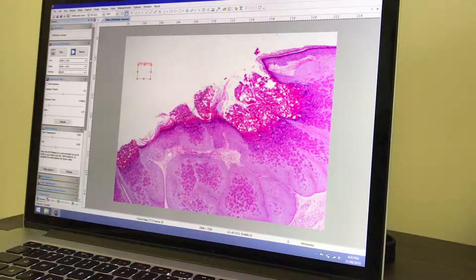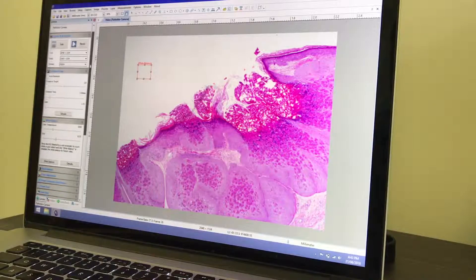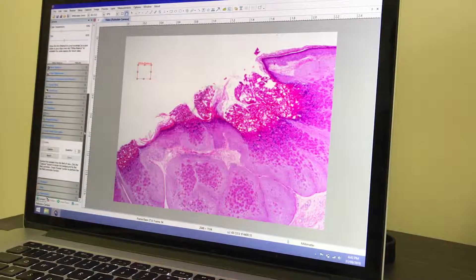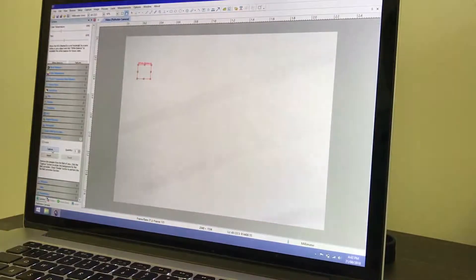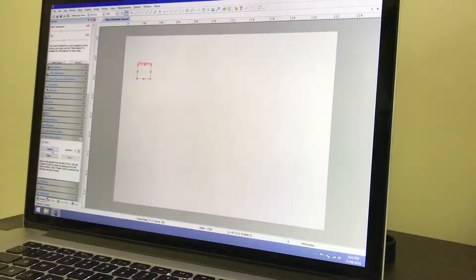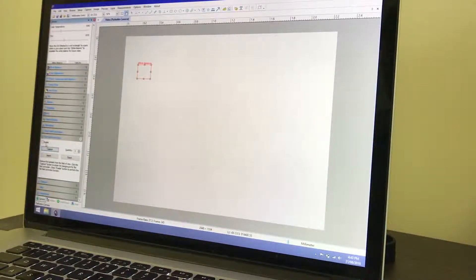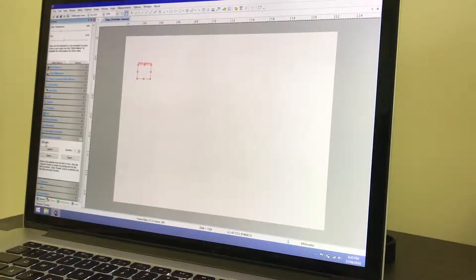Before starting the stitching, we need to perform one step called Flat Field Correction. This corrects any unevenness in the illumination of our view. All we need to do is remove the slide so we can see only the blank brightfield view. Click Capture, and then check the Enable box. You'll see the illumination becomes even across the live view.